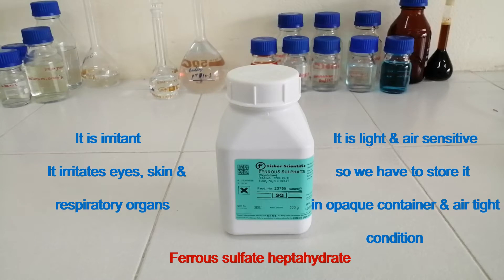This is ferrous sulfate heptahydrate. It is irritant — it irritates eyes, skin, and respiratory organs. It is light and air sensitive, so we have to store it in an opaque container and airtight condition.